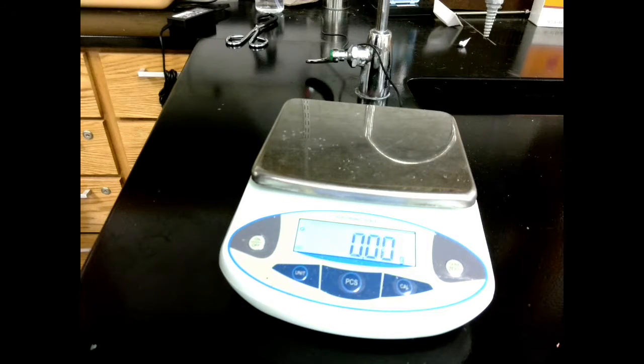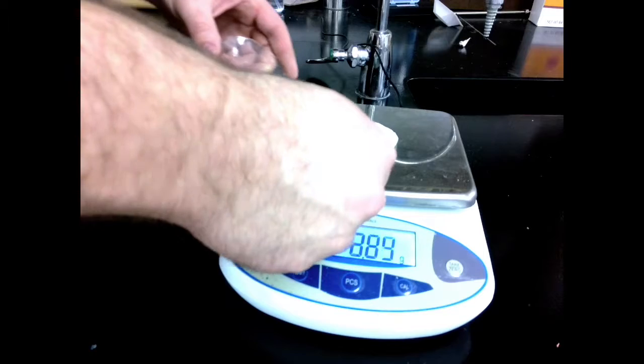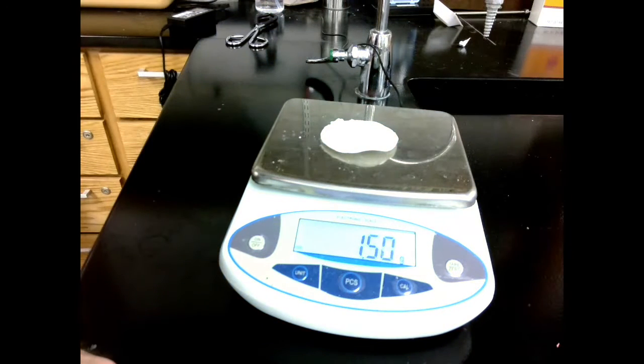With our scale set to 0, let's place our aspirin and our filter paper onto the scale. Take our weight that we get here, this 1.5 grams, subtract the weight of our filter paper from it, and we will have our final aspirin yield.